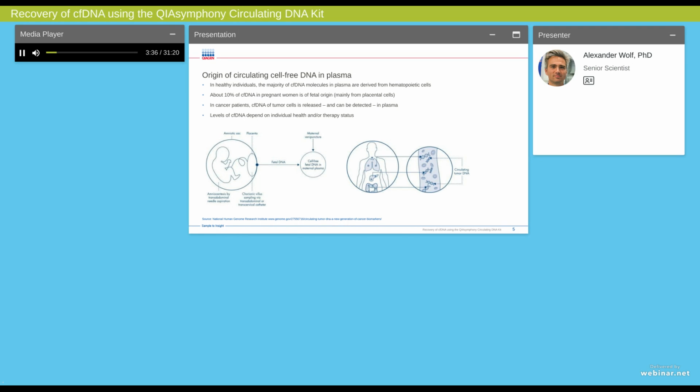Analysis of the origin of cell-free DNA extracted from a plasma sample revealed that most DNA molecules derive from hematopoietic cells, which is not surprising because it simply reflects the high likelihood that dying leukocytes release their DNA into the surrounding liquid. Next, it depends on the size, the cell metabolism, and blood circulation of an organ how much cell-free DNA is found in the bloodstream, as indicated on the right figure by the lung, liver, or intestine.